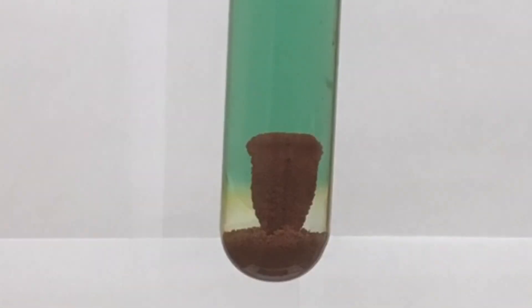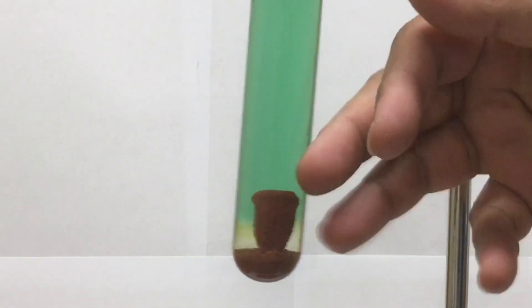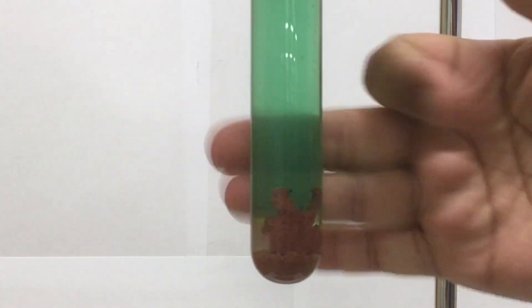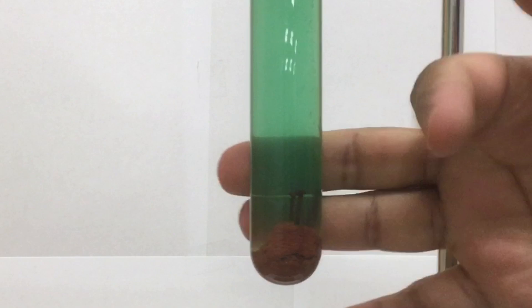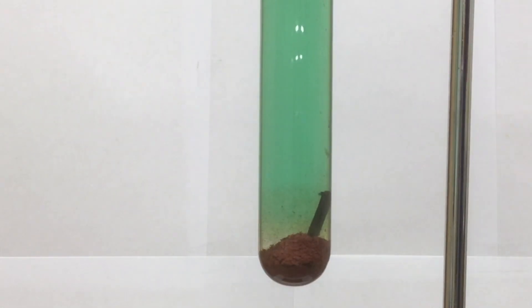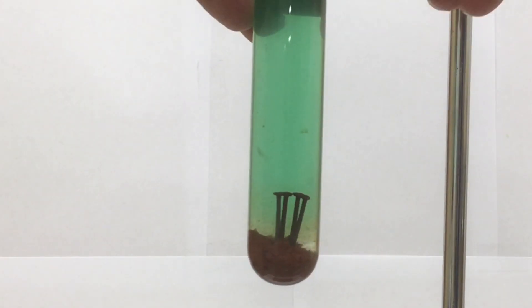The iron atoms in the nails are losing electrons, so they're being liberated into the solution, and that's why the iron nails are slowly being corroded away. Those electrons have to go somewhere, and they're being picked up by the copper 2 ions. When that happens, the copper 2 ions become plated into this brown copper metal. As those copper 2 ions are replaced, notice how that bright blue color we had at the beginning has disappeared.